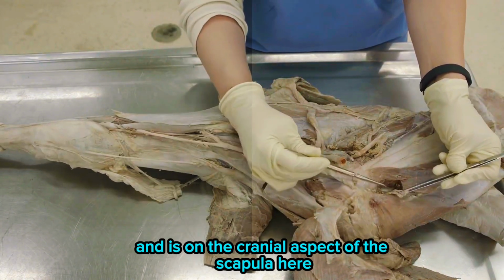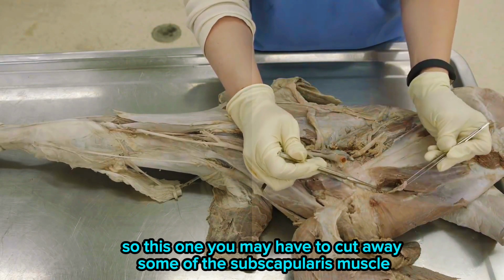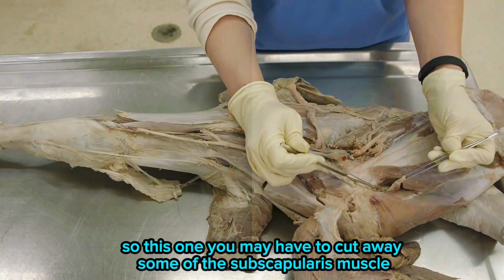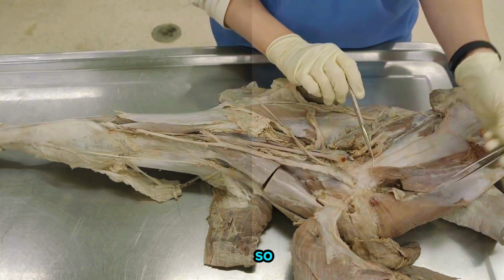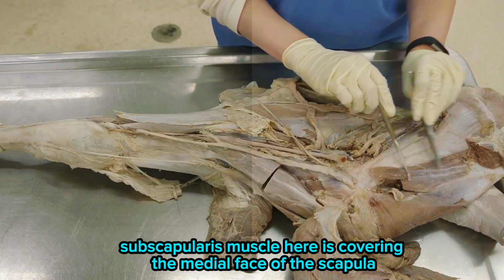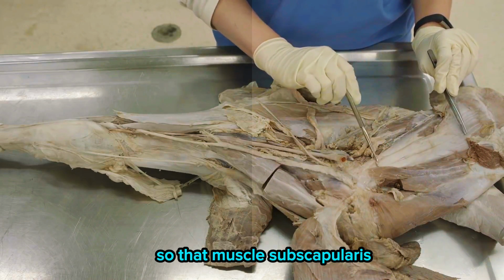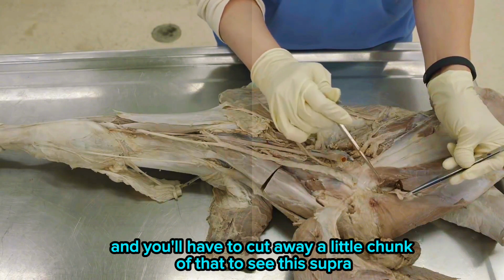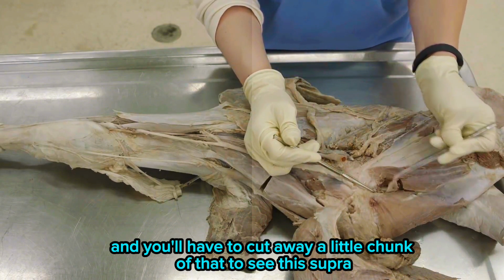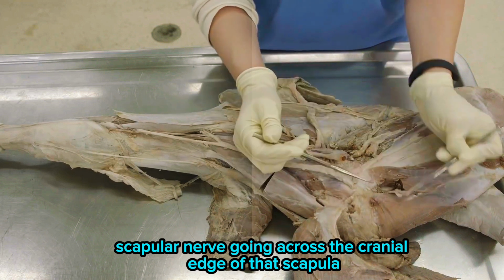Then we also have the suprascapular nerve, and that one is more proximal yet and is on the cranial aspect of the scapula here. For this one, you may have to cut away some of the subscapularis muscle. The subscapularis muscle here is covering the medial face of the scapula. So you'll have to cut away a little chunk of that to see this suprascapular nerve going across the cranial edge of the scapula.